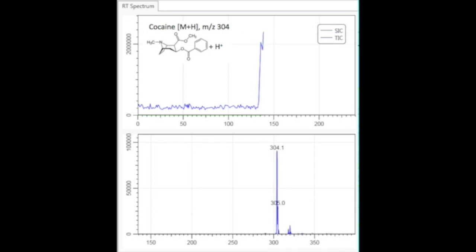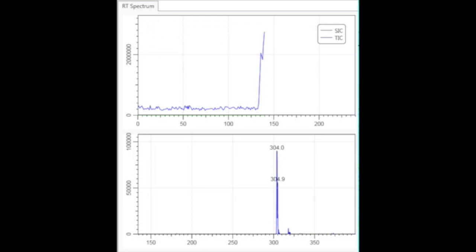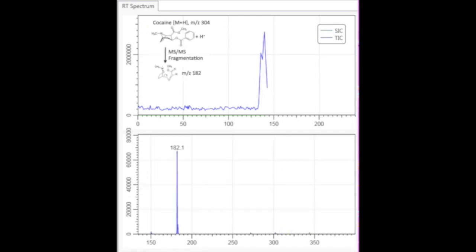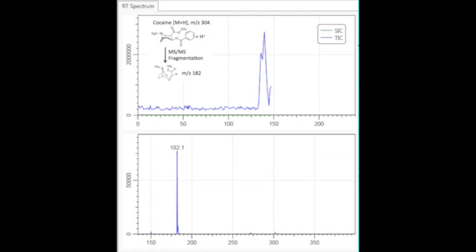Just given that something has a mass of 304, we can't know it's cocaine. So we're going to turn on fragmentation and capture that 304 ion and see what it fragments into. We're going to program the instrument to isolate only the 304 ion and put energy into it. When we do, you see we get this peak at 182.